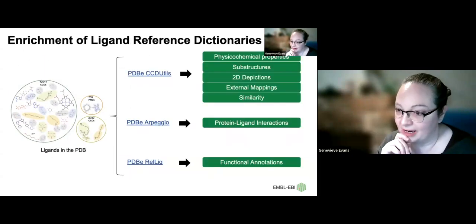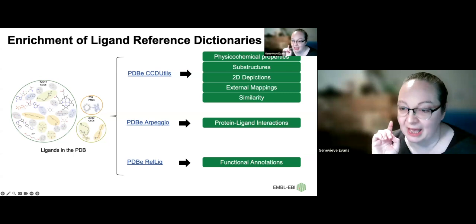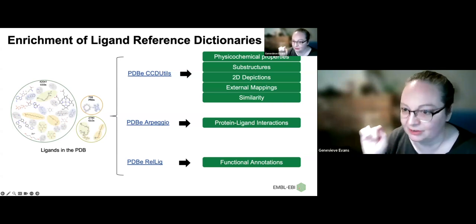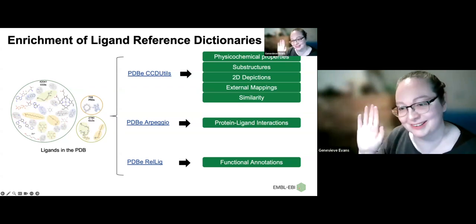That can sometimes be quite a helpful way to think about the ligands in the context of the protein: go to the protein pages, where again the central table has links to every instance. If you have the protein radio button selected and click on one of the UniProt IDs, that will take you to a KB page, and you can then go to the ligand page in the KB.